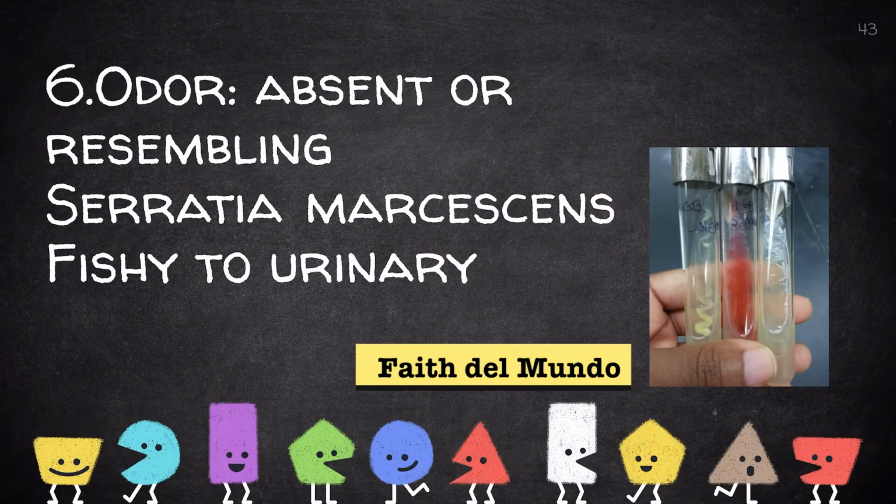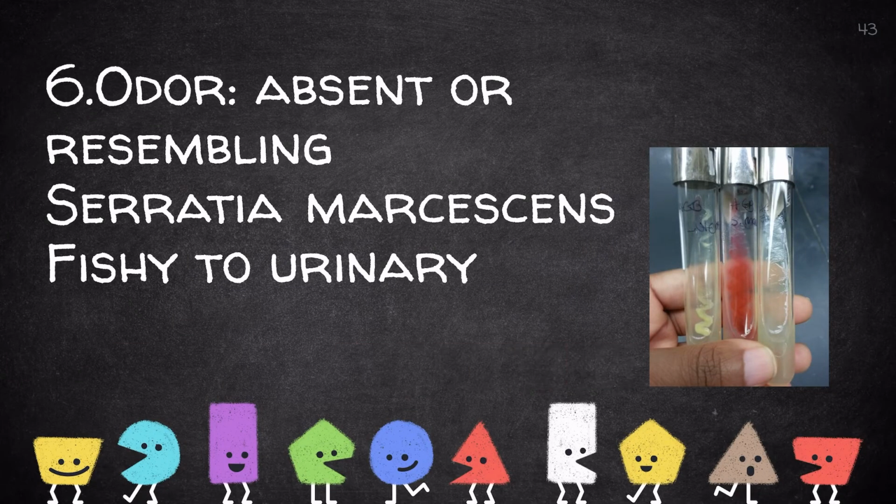The bacteria presented on the slide is Serratia marcescens. The odor is difficult to describe. It is often related to a fishy or urinary smell. Different observers may have different perceptions of the odor.